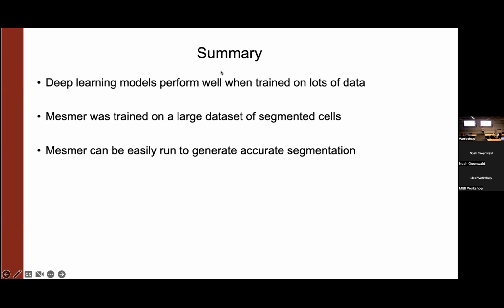And so that would be basically the whole new TissueNet data set, where a lot of the training data in TissueNet came from not highly multiplexed imaging platforms. And so there weren't many examples of really deep panels that had this type of information. Now that there are many more commercially available multiplexed imaging platforms and people are publishing a lot of data sets, I think it would be reasonable that someone could go in and start doing this. And I think that would help to resolve some of these corner cases.